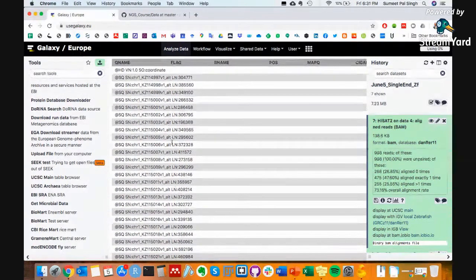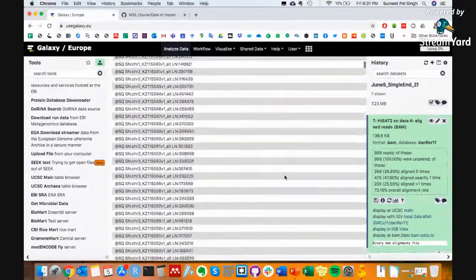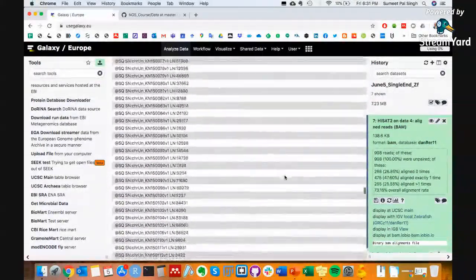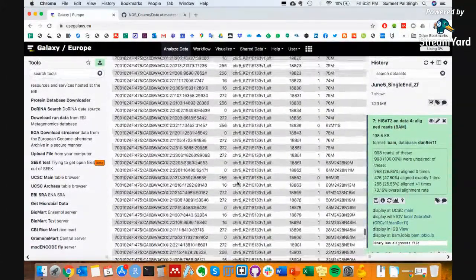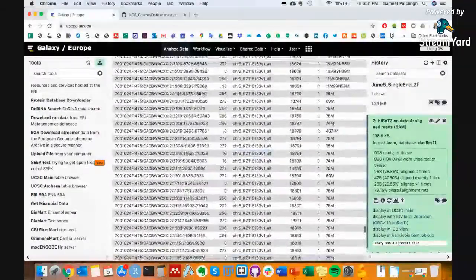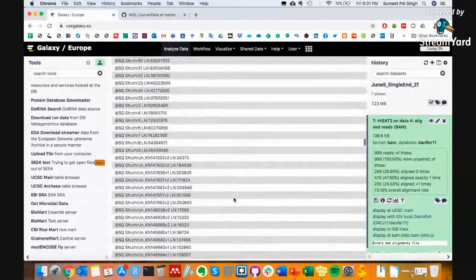This is how exactly the BAM file is looking, right, at the top. So Galaxy makes it human readable, right? So this is the top header. Yeah. And I think after a while you should start seeing some sequences. Yes. So here now you start seeing your sequences, right? So this one has mapped to chromosome 5 and so on and so on, right? So now you have found the location of each sequence in your genome.